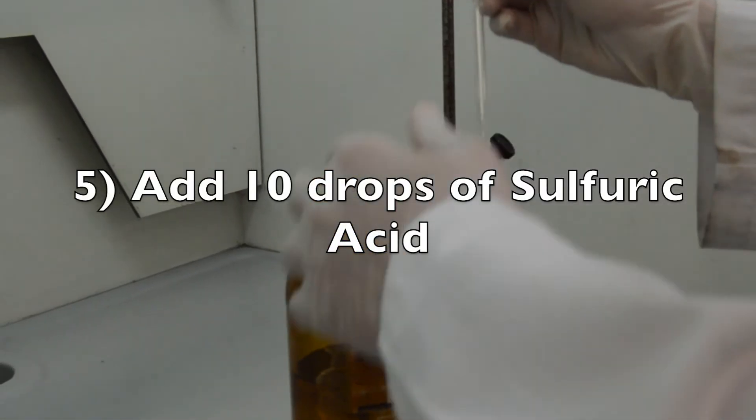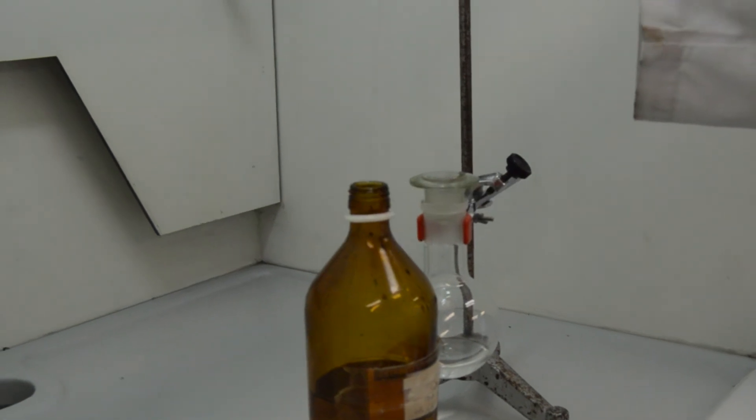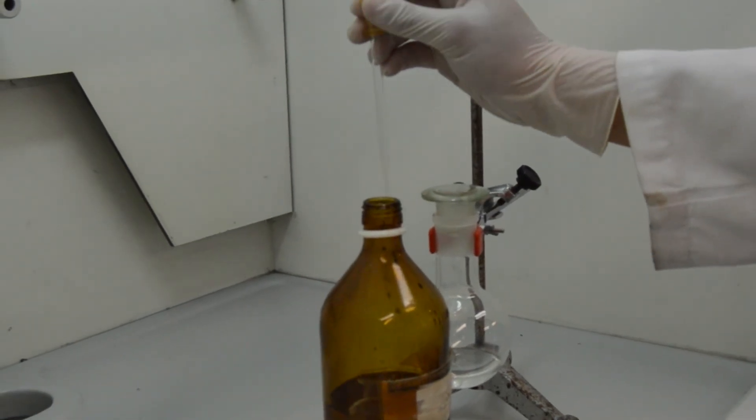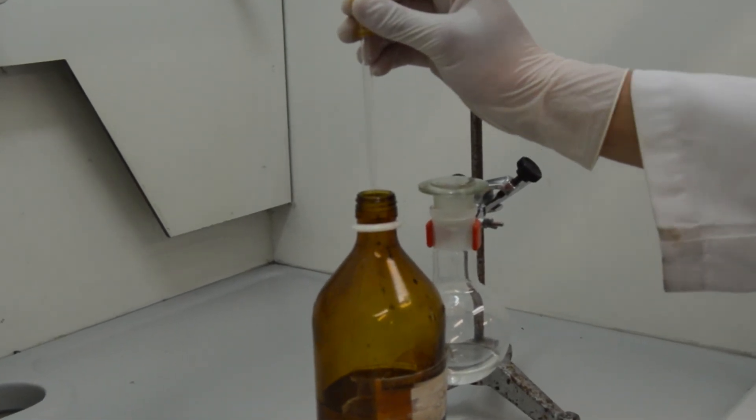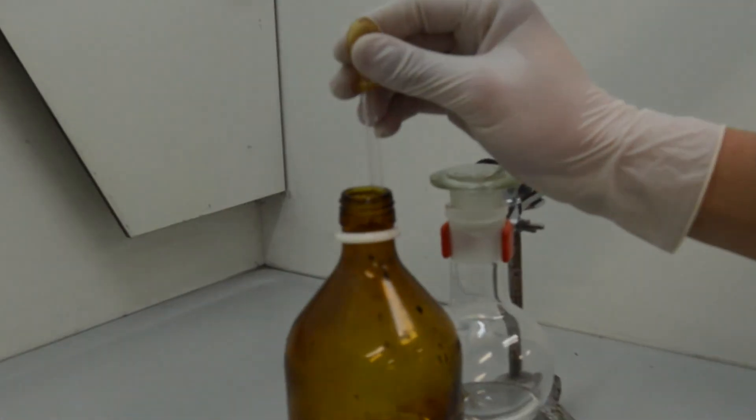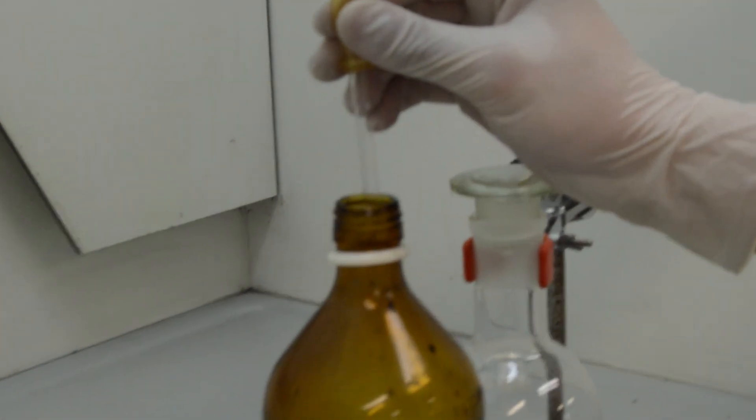In this esterification, we are going to use a catalyst in order to increase the reaction speed. We will do Fischer esterification, since it is the esterification of a carboxylic acid with an acid catalyst.